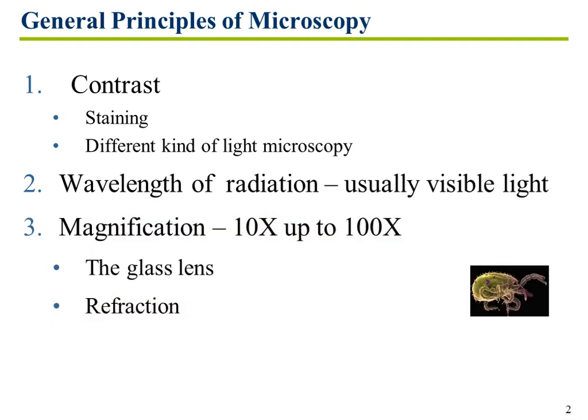So, another thing to think about is magnification. I've already told you there are 4 objectives that you can have on a microscope that you're probably familiar with. 4, 10, 40, and you may or may not have seen 100. Those are the 4 usual ones. These objective lenses are made of glass, finely ground, expensive. Their job is to make your object larger.